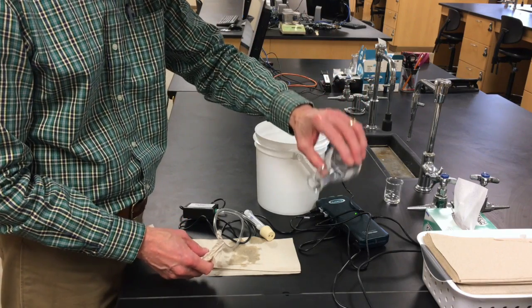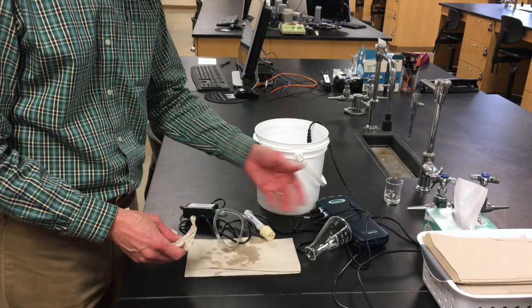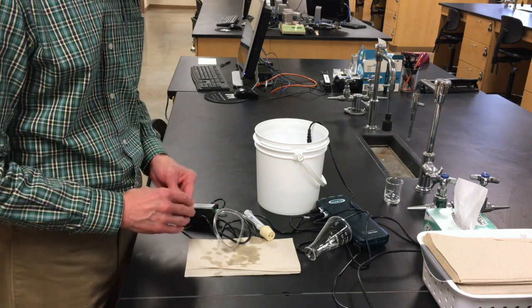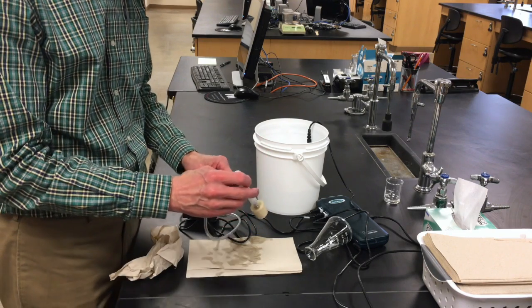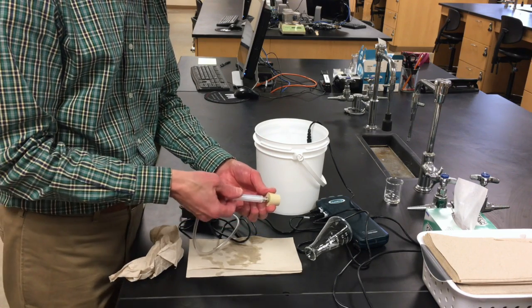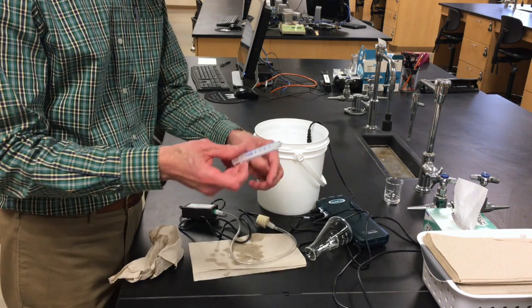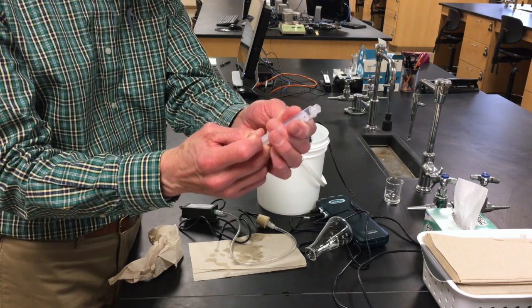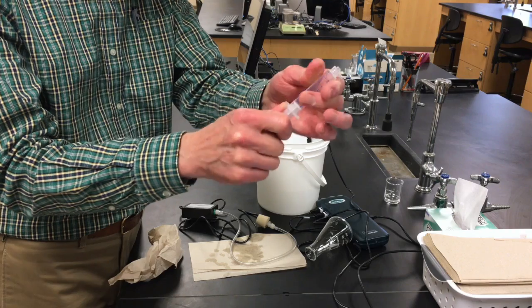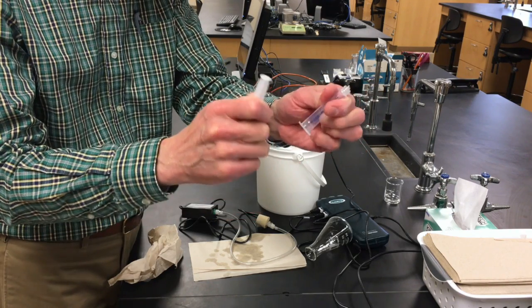I'm going to set this aside, and I'm actually going to lay it down. The vapors will come out better if it's laying down, and now that's ready. 2 other things need to be cleaned here, and the first is the syringe. Let's take the syringe off, unscrew it, and the way to do this is to actually take this apart. It's a little bit stiff, but when you get to the end, use your thumb to push on this part and pull it right apart.